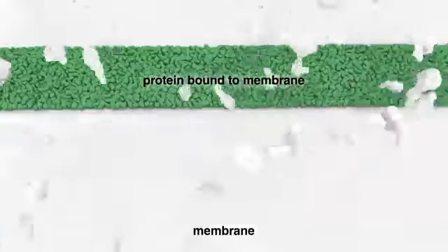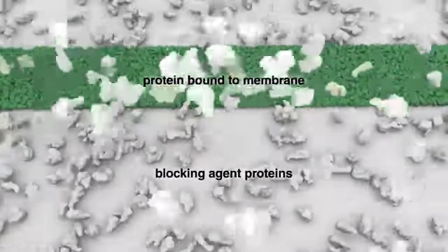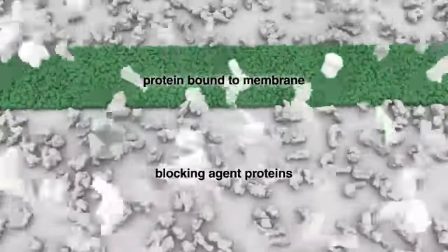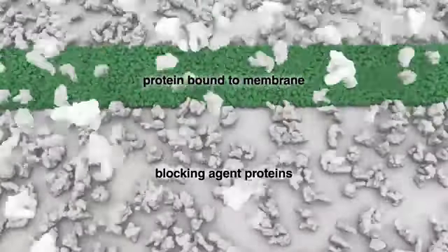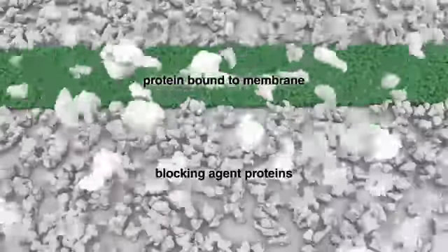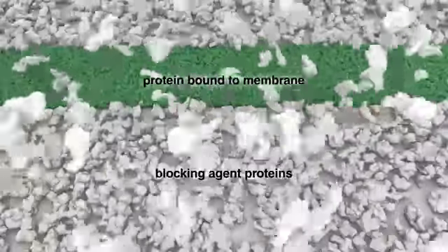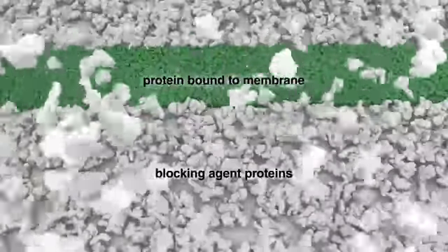The membrane is incubated with a solution typically containing a blocking agent, such as dry milk or purified proteins, in a mild detergent. Proteins within the blocking agent will bind to the areas within the membrane that are not already occupied by bound proteins, preventing nonspecific binding of antibodies in subsequent steps.